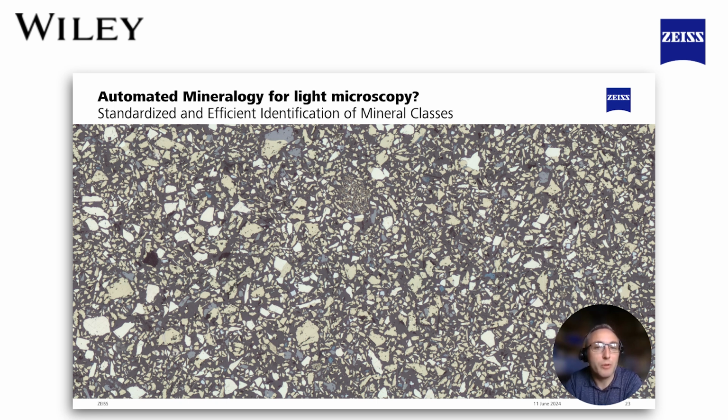And we want to be able to use light microscopy to try and do a similar job. And this has never really been possible. And part of that reason is the classification technique that we've had. So that semantic segmentation technology has never been very good at really consistently tackling multiple samples and being able to understand or being able to apply those classifications that we created in one sample and apply them to another sample.